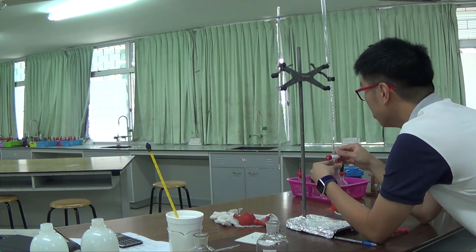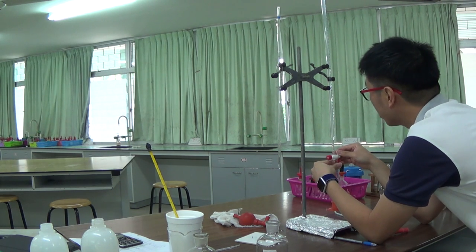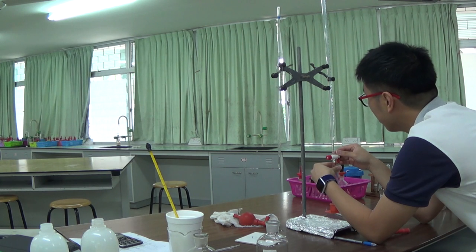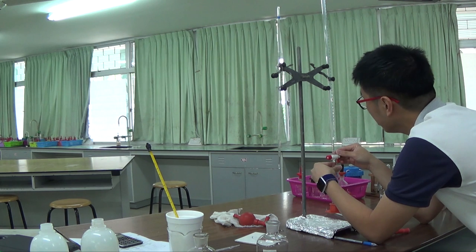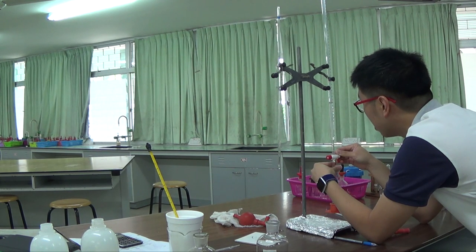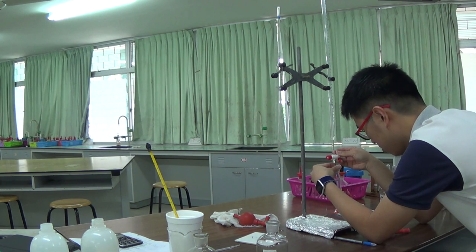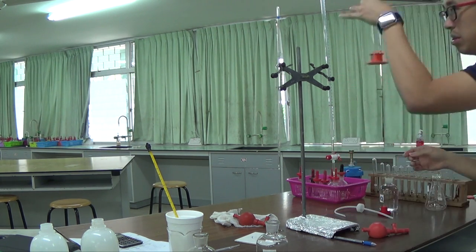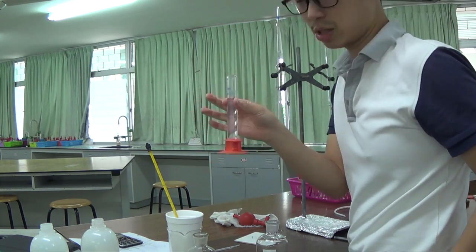My eye should be on the burette, because it measures the accurate volume of the solution, not actually the measuring cylinder. It's the solution in the burette that is measured accurately. So slow down towards the end and do it drop by drop because we don't want to overshoot it. Okay, so I have my 25 ml of solution.